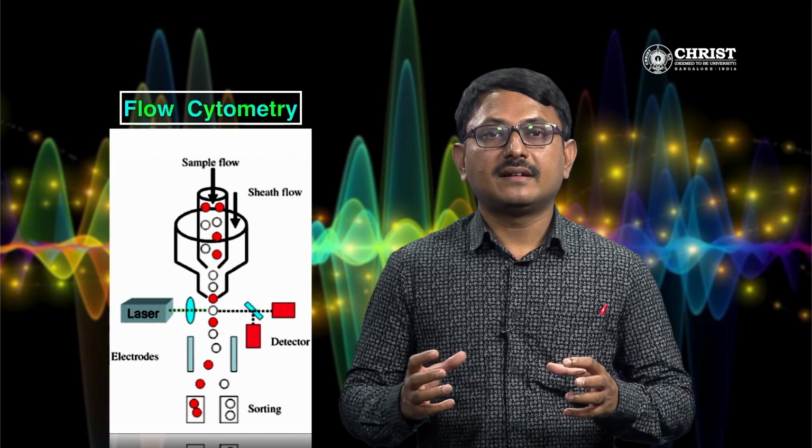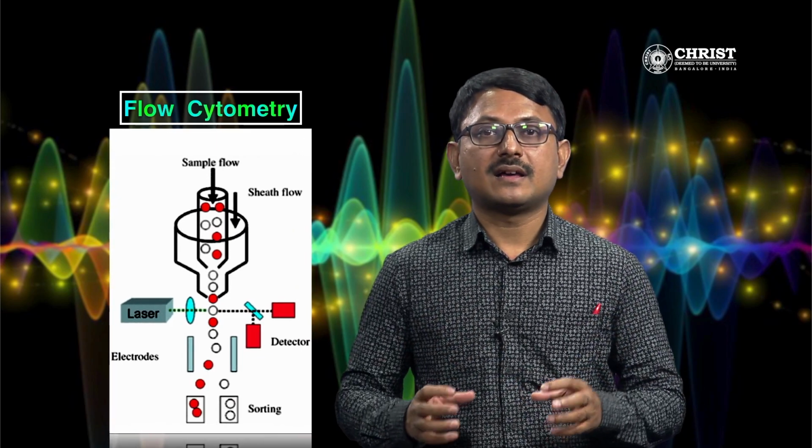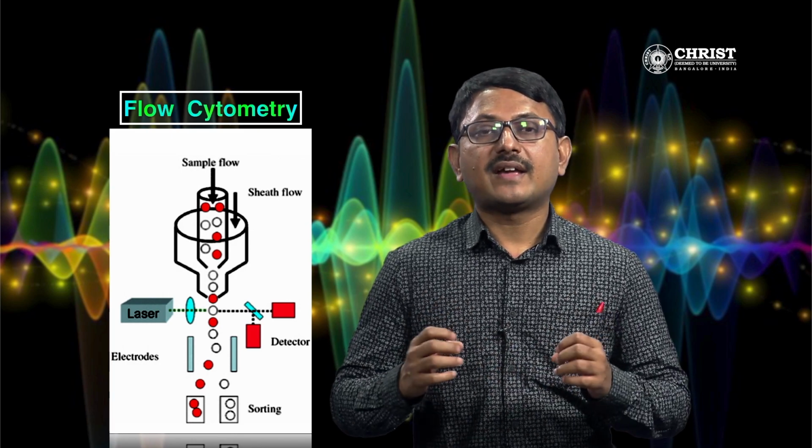The optic system is made up of lasers which illuminate the particles present in the stream as they pass through and scatter light from the laser. Fluorescent molecules that are on the particle emit fluorescence, which is detected by carefully positioned lenses. Generally, the light scattered from up to 6 or more different fluorescences is determined for two different angles. Optical filters and beam splitters then direct the light signals to the relevant detectors, which emit electronic signals proportional to the signals that hit them. Data can then be collected on each particle or event, and the characteristics of those events or particles are determined based on the fluorescence and light scattering properties.